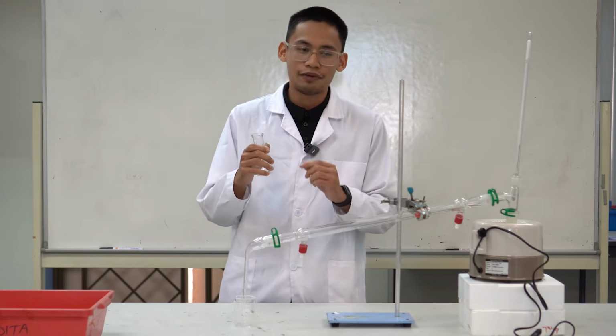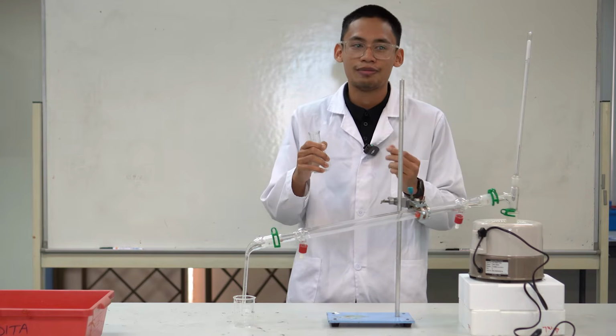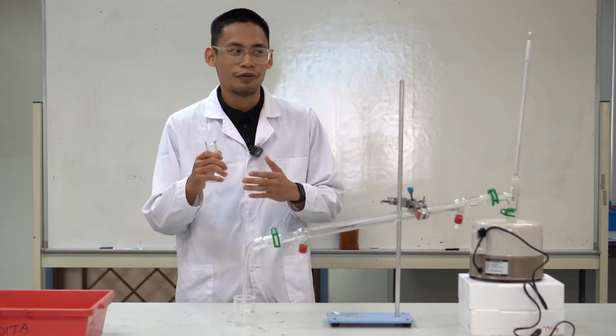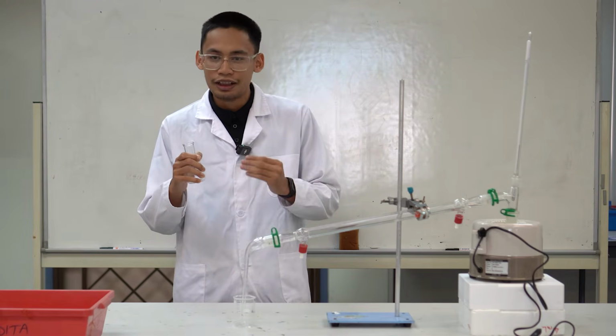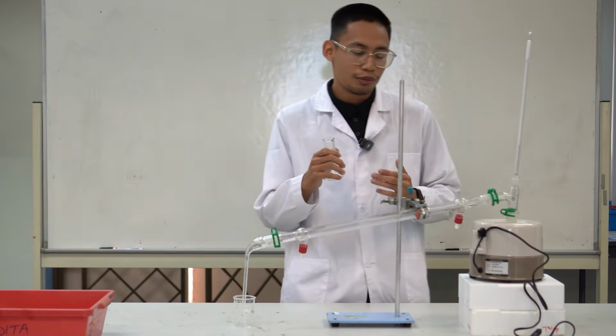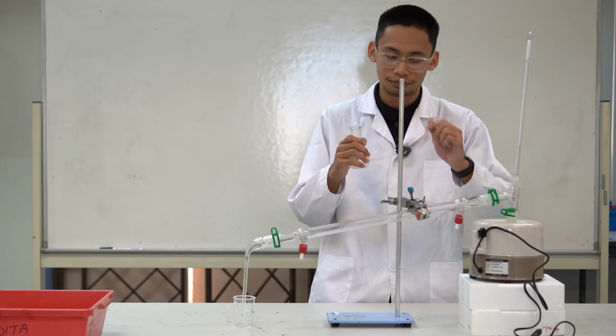After we add anhydrous sodium sulfate, we need to add boiling stones, or in the experiment we normally use granules. The purpose of adding these granules is to ensure that when we boil the mixture, it will boil smoothly.